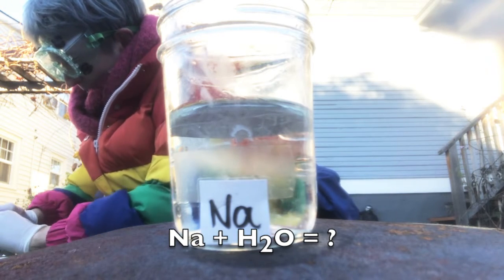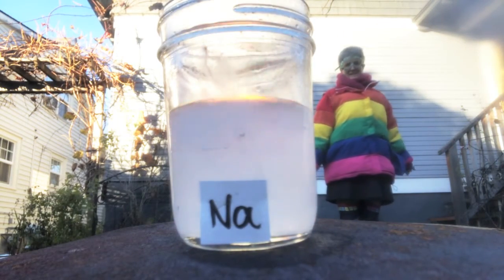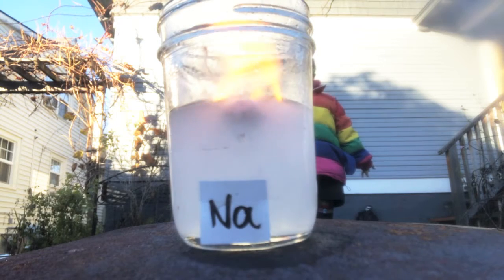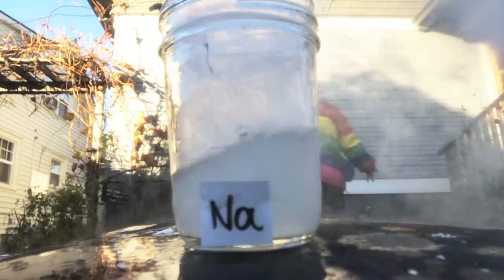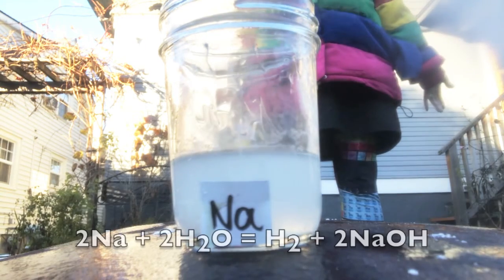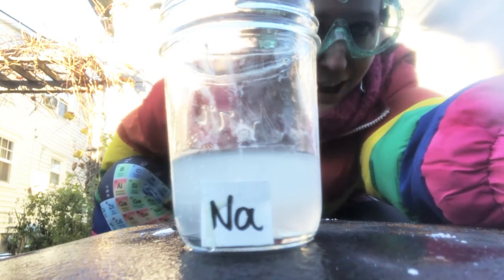And here we go. So guess what? Sodium is more reactive than all of those. I wonder why. We'll talk about that when we get into chemical reactions.